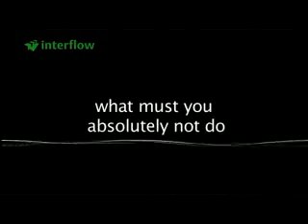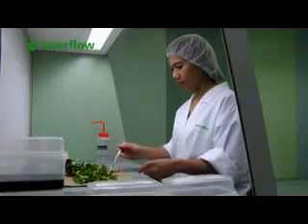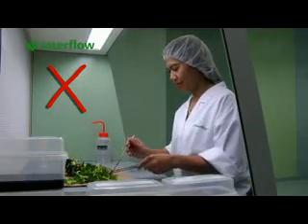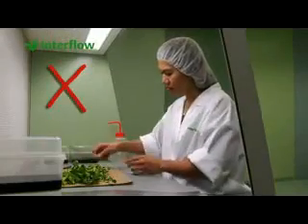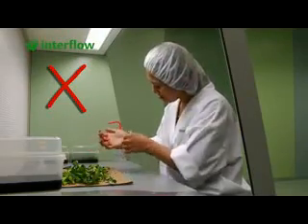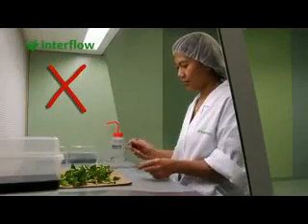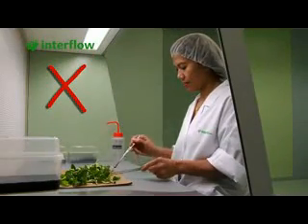What must you absolutely not do? It is not good to cough, sneeze, or talk. The bacteria which are released can be damaging to the product. Scratching or rubbing can also release bacteria that can contaminate the product. If colleagues pass close by the cabinet, this will disturb the air flow inside the working area.